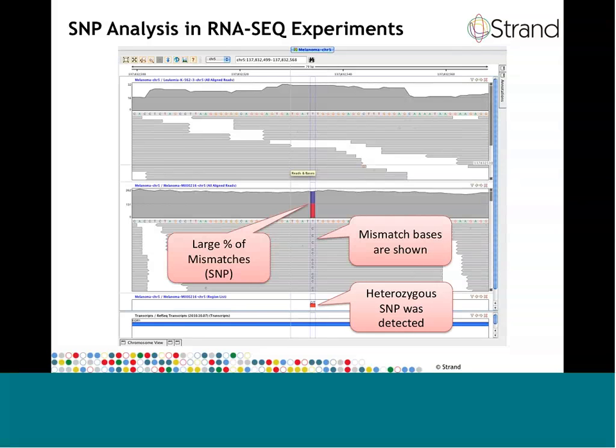Of course, this is merely a visual clue, and it's no substitute for a rigorous SNP detection algorithm. But when we perform the SNP detection workflow step, we do find that this SNP is significant. The SNPs are stored as a special region list that can be visualized in the genome browser, as shown here as well.